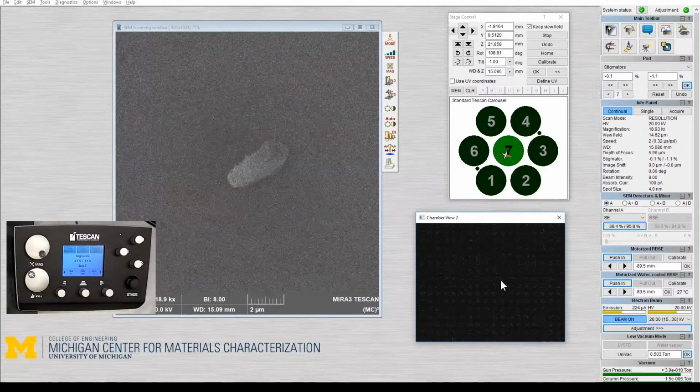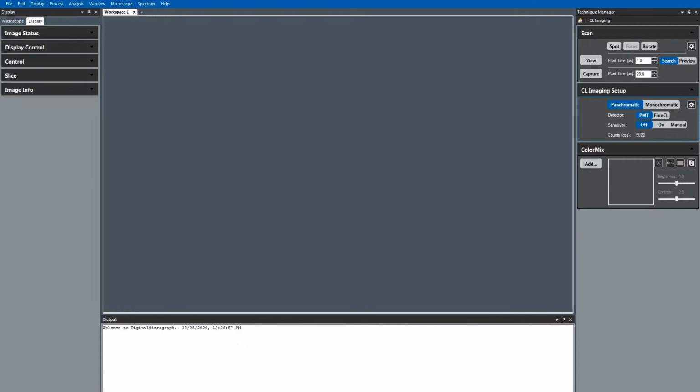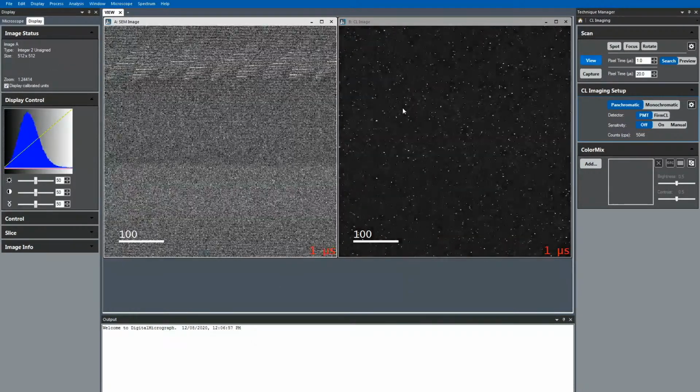And now obviously IR light is going to excite the photomultiplier. So we went from 280,000 counts down to 5,000 counts, which is more realistic as far away as we are from the parabolic mirror. I'm going to start a search. We're going to continue without MagCal.